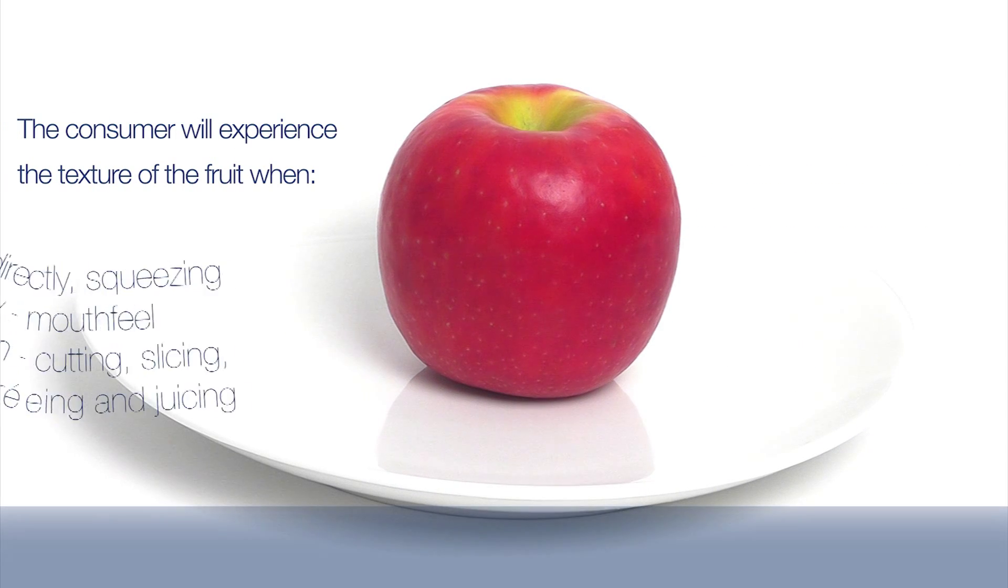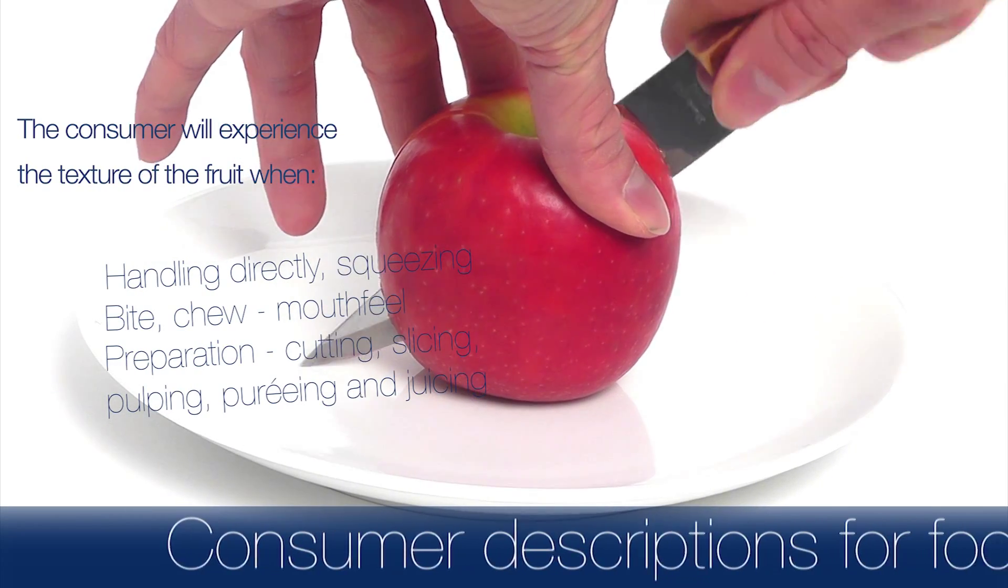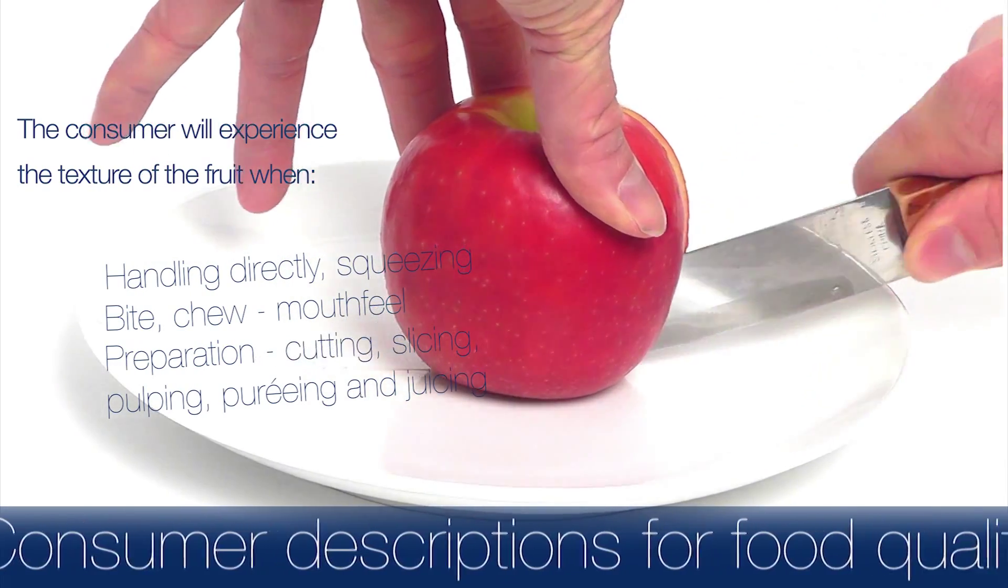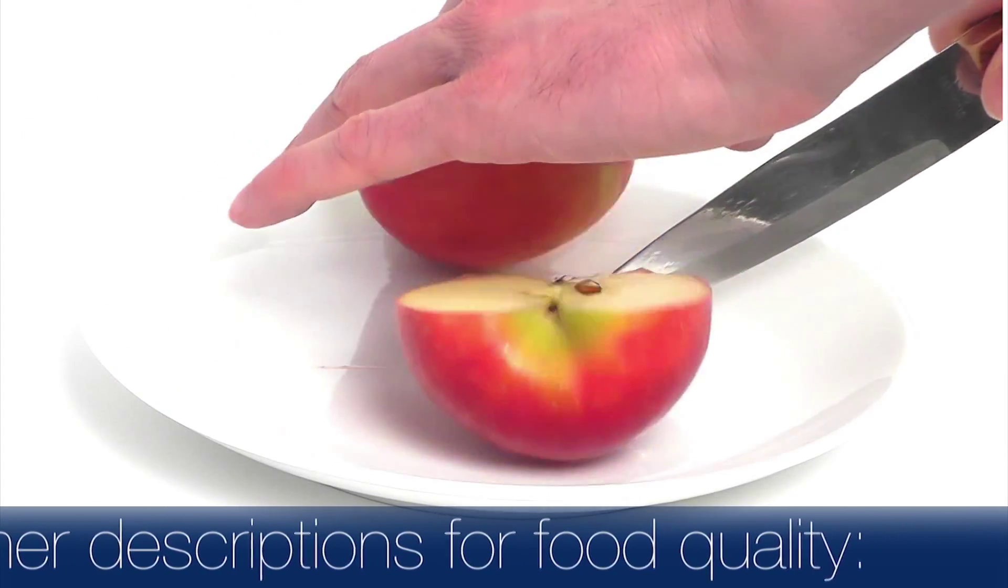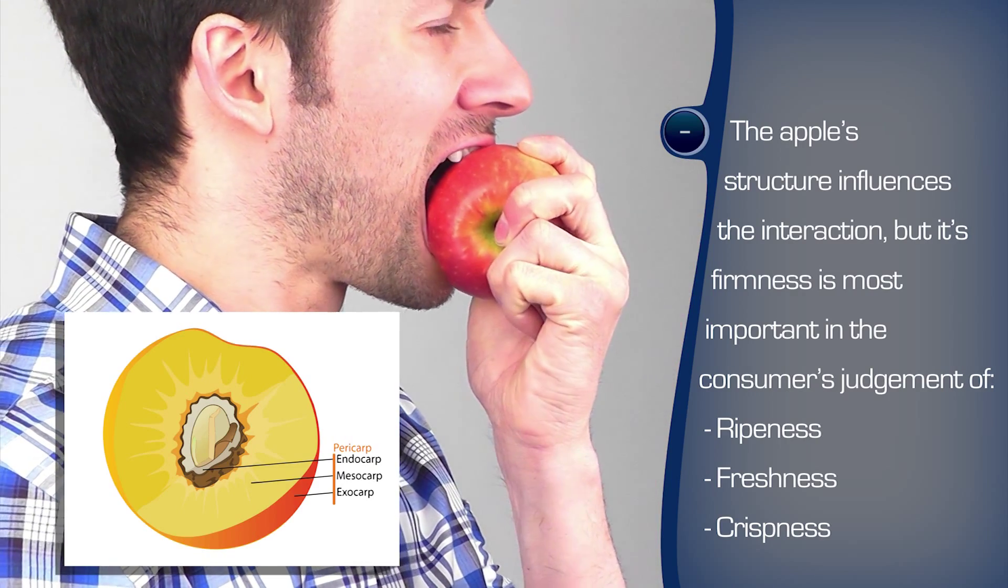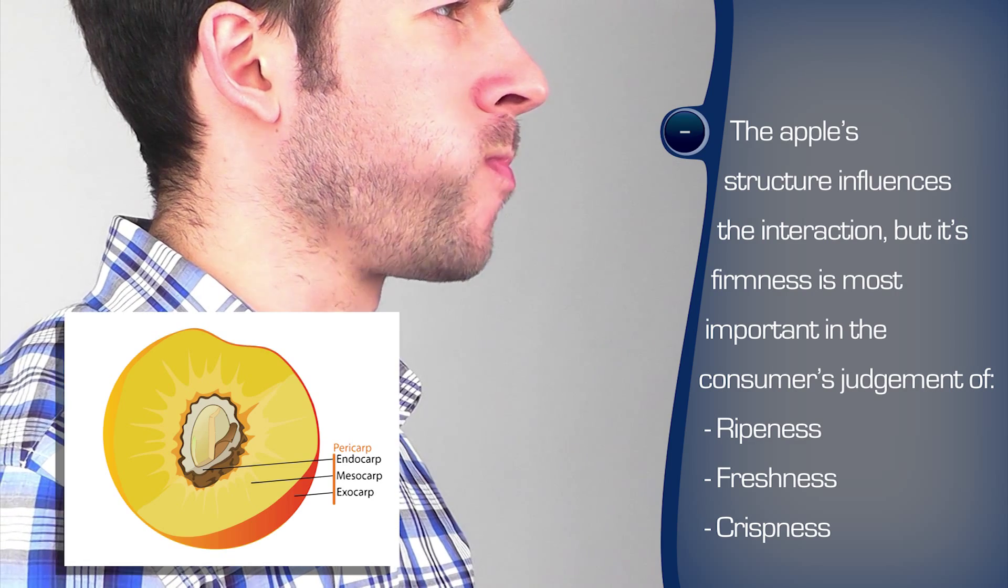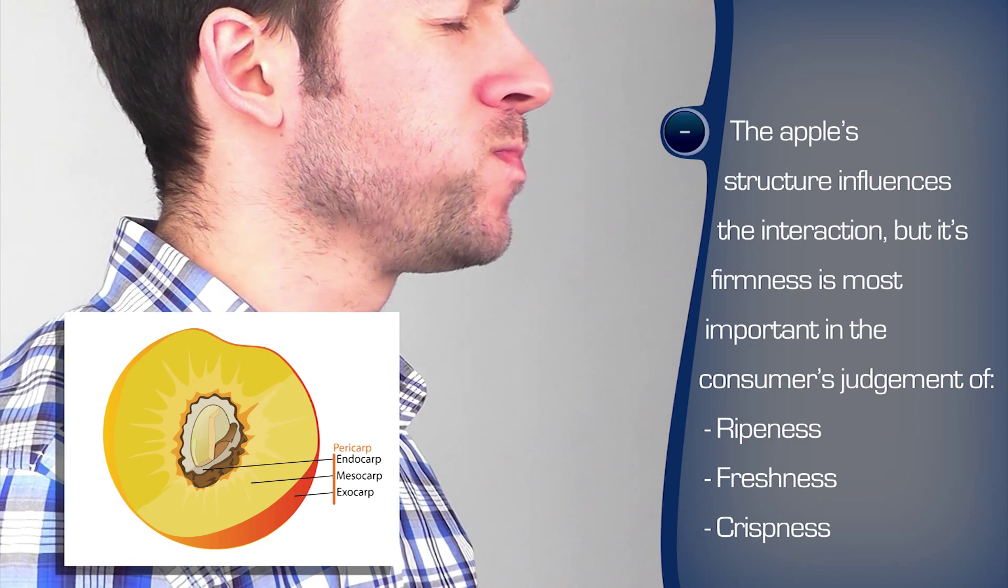A consumer may describe the sensory quality of food with different terms as they evaluate the texture through touch, mouthfeel and in other ways as they interact with the product. For a fresh apple, the firmness of the initial bite through the skin determines the crispness and the way the inner flesh yields as an important factor in conveying its ripeness.